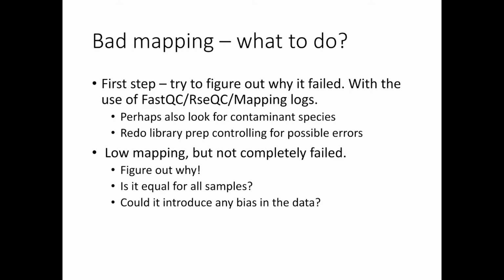But even though it might turn out that only 40% of the reads are mapping to your genome, that doesn't necessarily mean that you can't use those 40% and analyze it. It's just really important to keep it in mind that there might be something strange going on here.